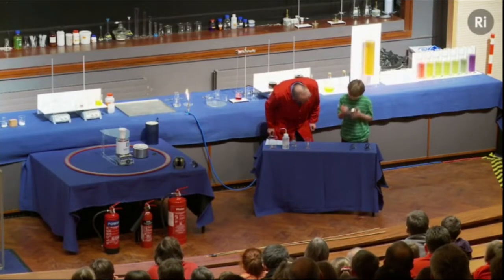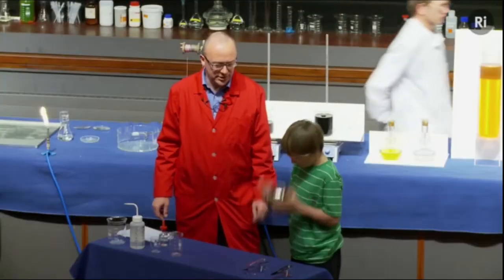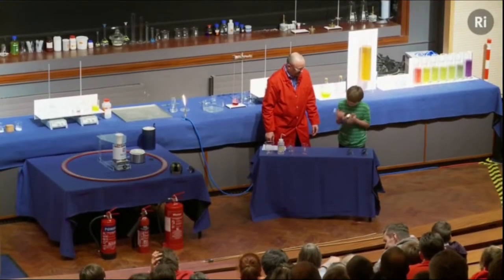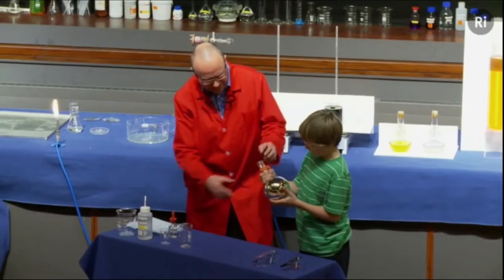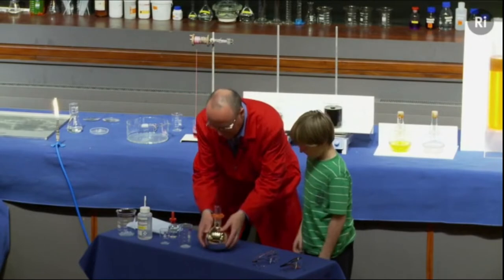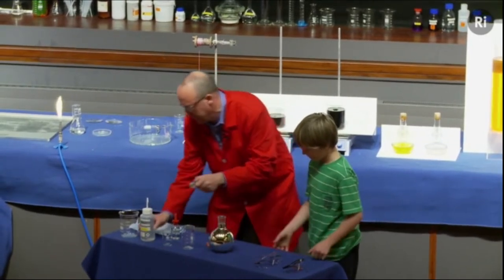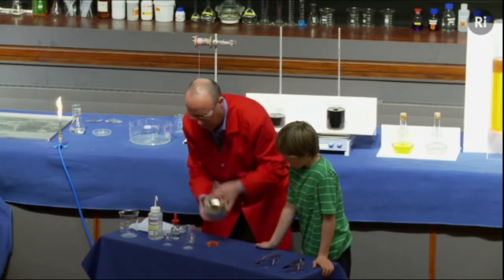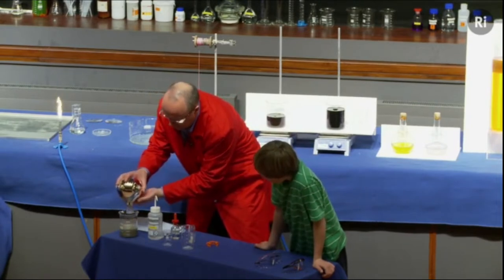Doing really well. Okay, let's just have a quick look. Almost there. Keep going a little bit longer. Still looking a little bit dark. Excellent. All right. Give it back to me then. Right, so I'm going to take the clip off. I'm going to take out the stopper. Just wash that off. And I'm going to pour out the remaining chemicals.